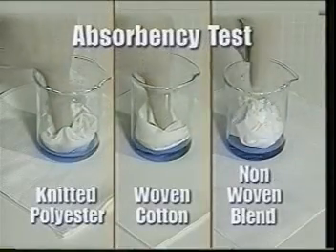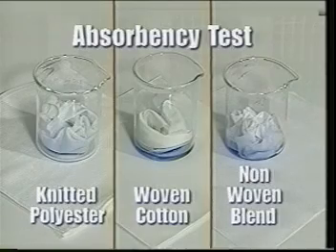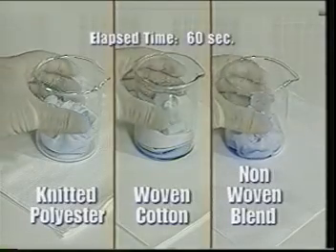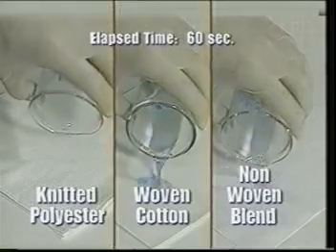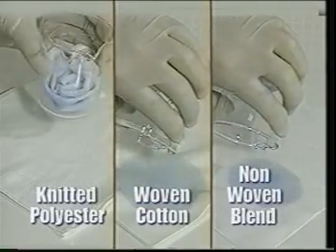Before we discuss using wipers to clean up spills, let's take a moment to look at wiper absorbency. Knitted polyester fabrics are more absorbent and cleaner than woven cotton fabrics or non-woven blends.